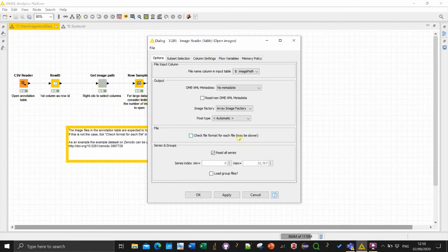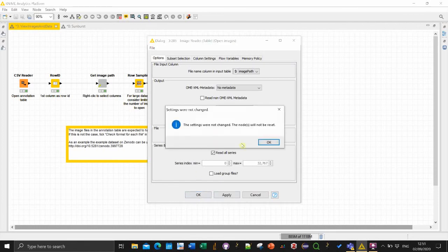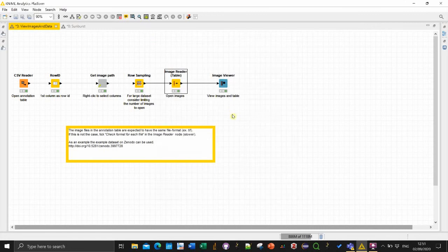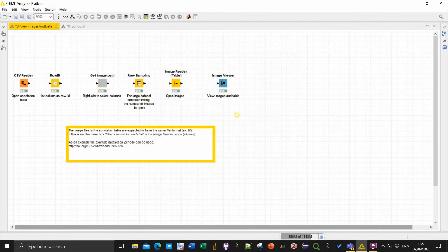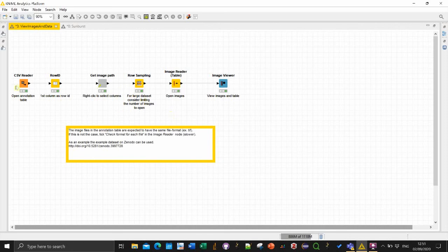All the image in the table are expected for this workflow to have the same extension, the same file format. If it's not the case then you should change a setting here which is check file format for each file. Which is slower if you know that all your images are the same format then you can just leave it unticked and it will assume it's the same file extension based from the first image.